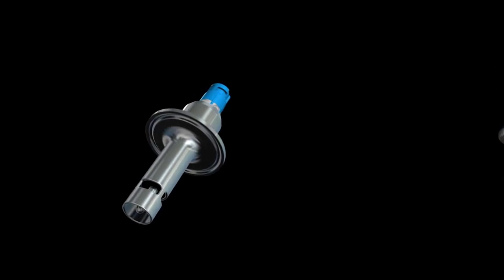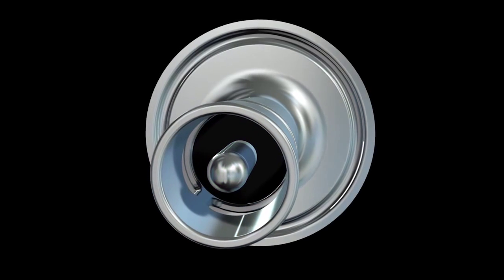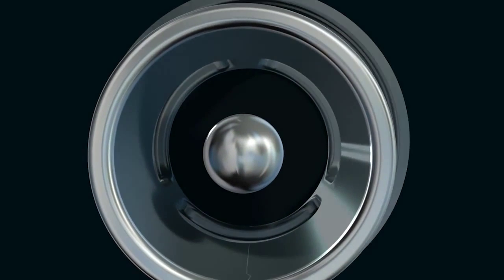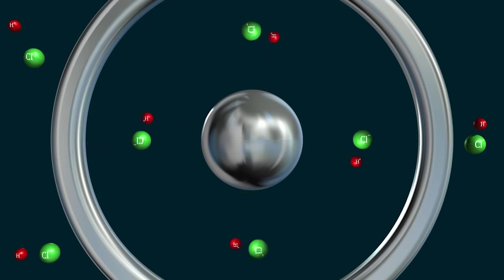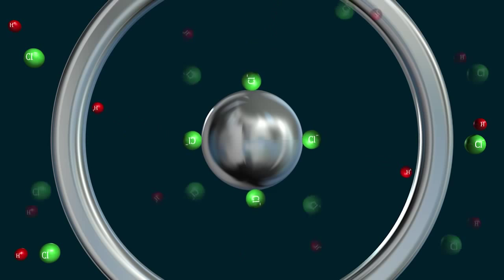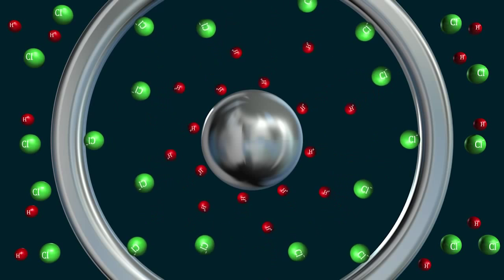In case of the conductive measuring principle, two electrodes are positioned opposite from each other. An AC voltage is applied to the electrodes, which generates a current in the medium. The cations move to the negatively charged electrode, while the anions move to the positively charged electrode. The more free charge carriers the liquid contains, the higher the electrical conductivity and the current flow.